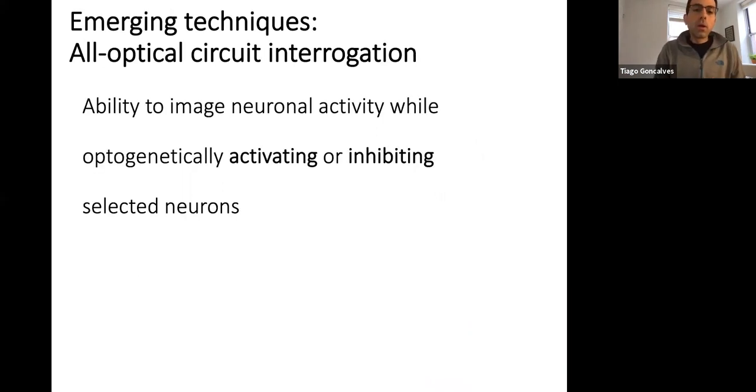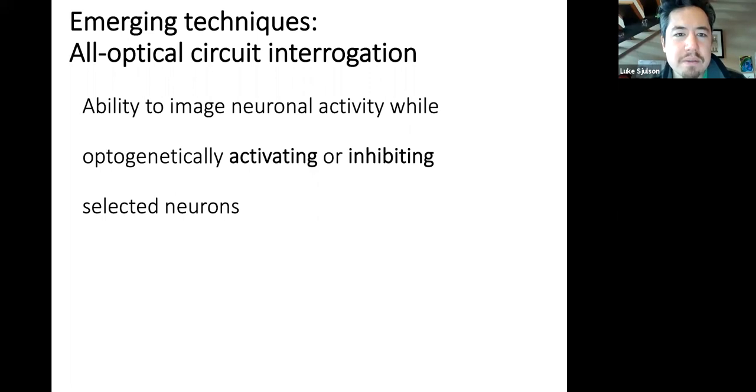Okay, so I have a couple of slides now very quickly about emerging techniques. Some of these are not really emerging at all in the sense that they've been emerging for 5 years or so. Tiago, you're still kind of a little cutting edge.